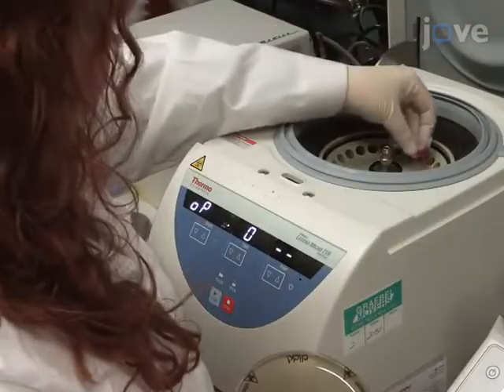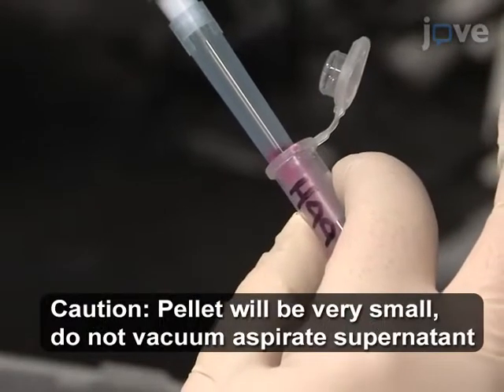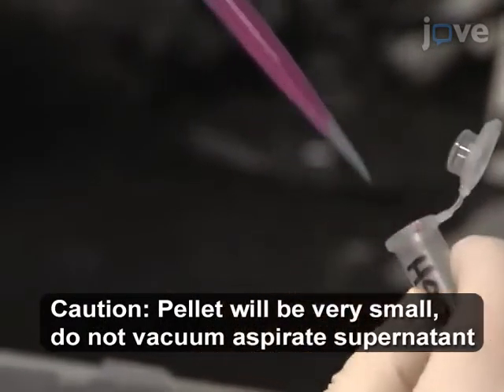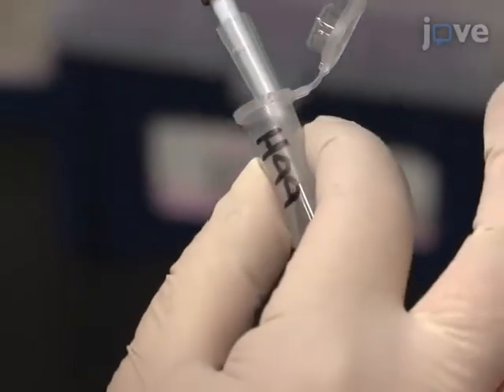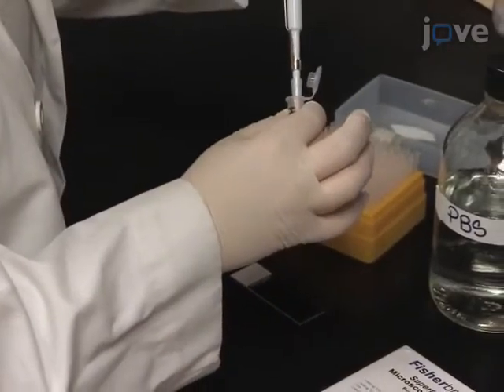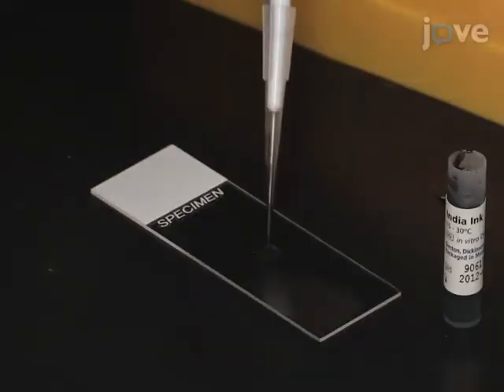The next day, collect the cells by centrifugation and remove all but the last 10 microliters of the supernatant. To stain the yeast with India ink, resuspend the pellet in the remaining supernatant and transfer 4 microliters of the cell suspension and 4 microliters of India ink onto a glass microscope slide.